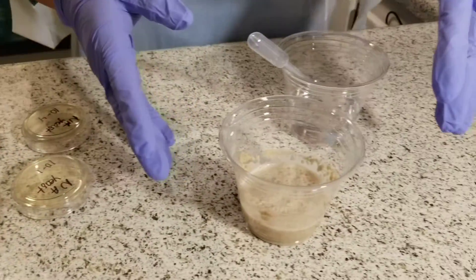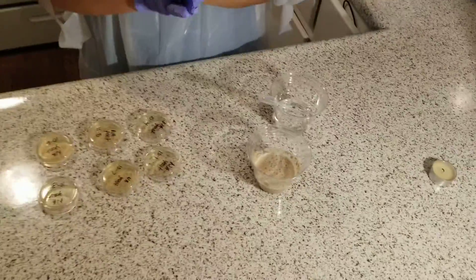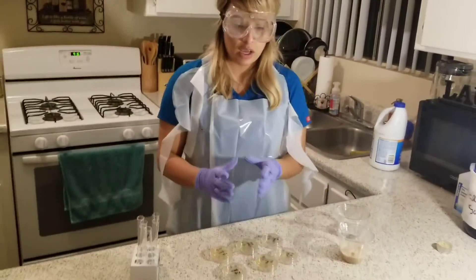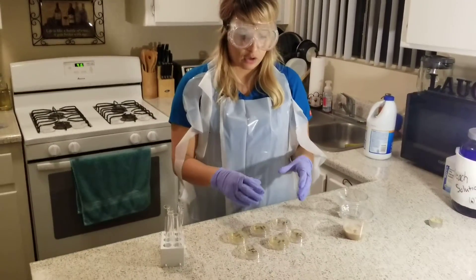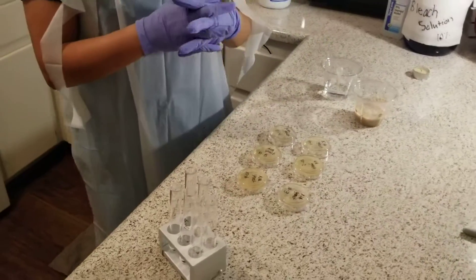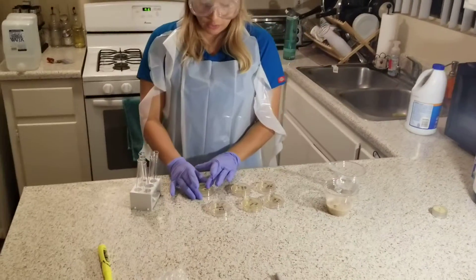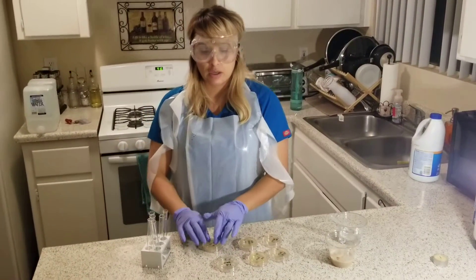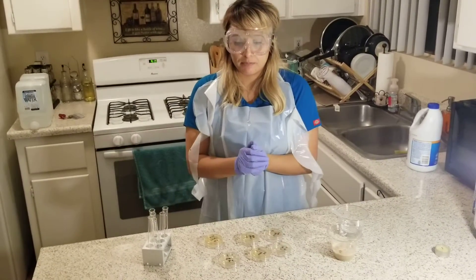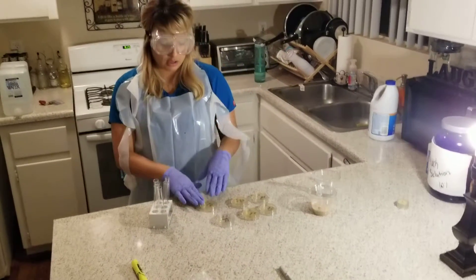I have the yeast, which is the S. cerevisiae, and that is what I am going to dilute. The goal is to have the microbes on the plate. The first plate should have a high number of colonies, and then I'm hoping to dilute them down. My goal for the 10⁻⁶ dilution is to get a CFU, which is a colony forming unit of the microbe. I'm hoping to get between about 30 to 300 colonies on the last one.